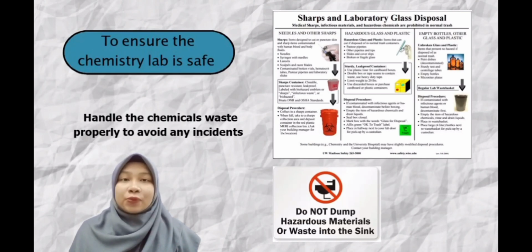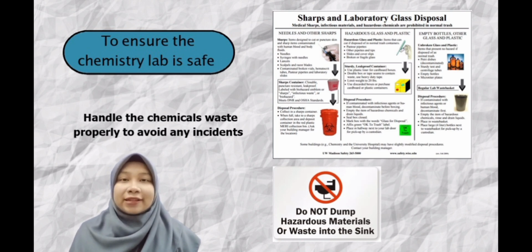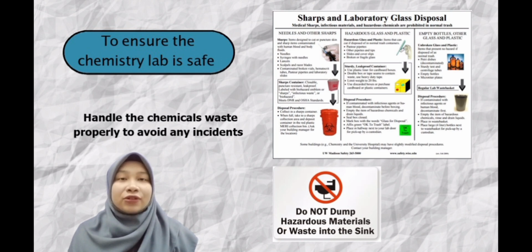Last but not least, properly handle the chemical waste to ensure that there is no harm to our body and other people. Before I end my part, let's take a look at this video on how to handle chemical waste properly.